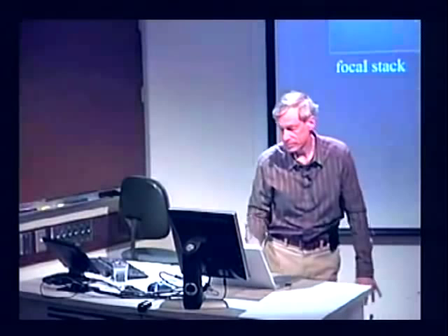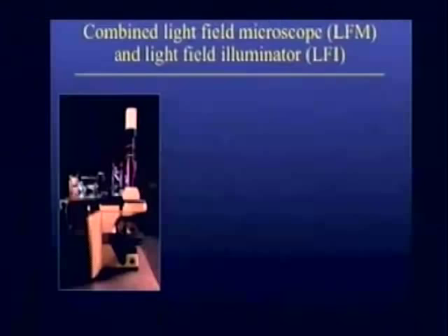So the last thing I want to talk about is our recent work on an illumination system. If what I just described to you was a microlens array followed by a camera, this is a microlens array followed by a video projector. The whole optics chain is otherwise the same. So that means that with the video projector and the microlens array, I can turn on any ray in the four-dimensional light field that I'd like, or turn on any combination of them independently.